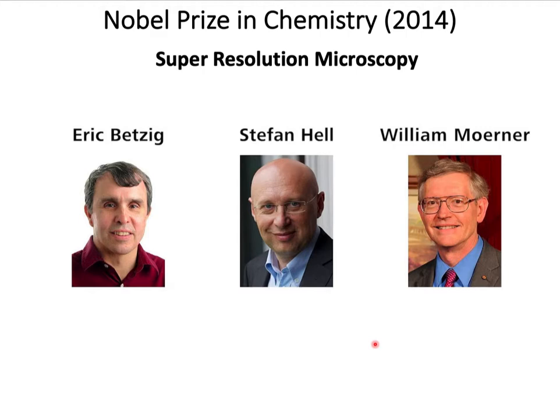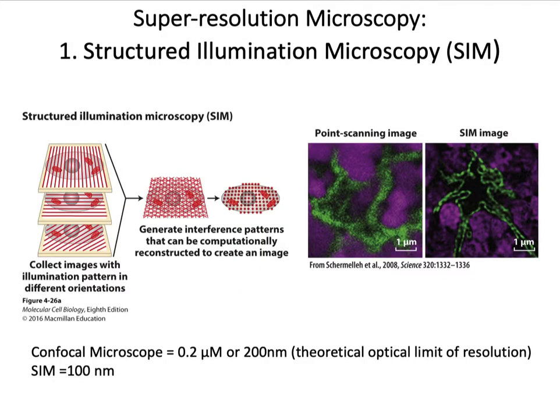Please note that super-resolution microscopy is a generic name and is not just one type of microscope or technique. Rather, there are several different types of systems and techniques used as per the need and application. The first breakthrough that sets super resolution microscopy apart is that they can generate light microscope images with up to a nanometer resolution. New approaches to super resolution microscopy circumvent the light microscope theoretical limit of resolution, or the ability to distinguish two close objects.